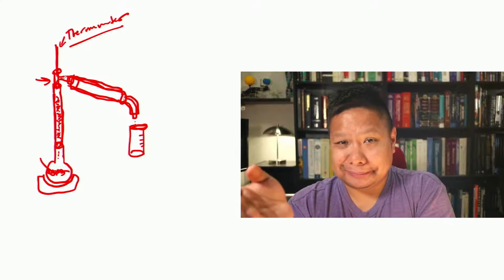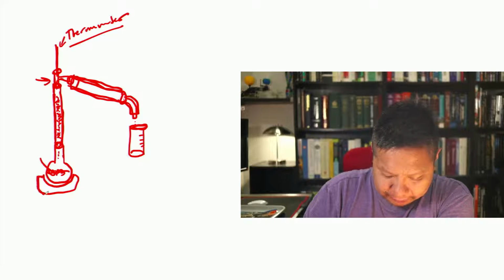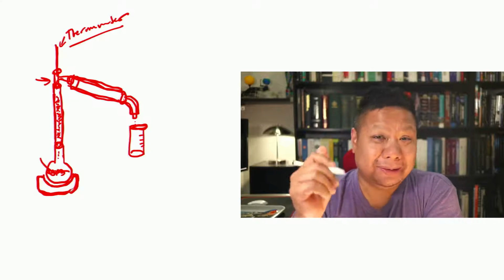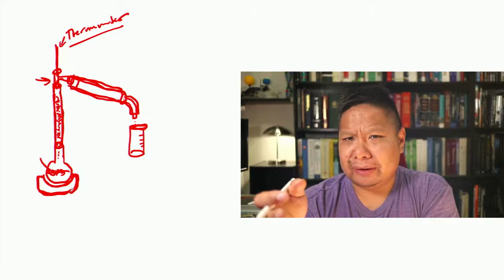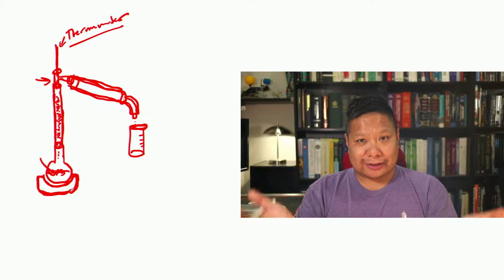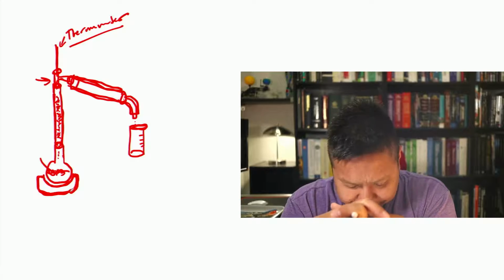Oh, I forgot to tell another story. In the organic lab, we always use things like heating mantles or hot plates or baths to heat things, right? And you should absolutely never use a Bunsen burner, because the vast majority of organic solvents are highly flammable, right? And they also have high volatility. They have low boiling points. So the vapors, if you pour it into a flask, will overflow from the flask and float on the outside of the flask. And so that's why you're not supposed to use an open flame, like a Bunsen burner flame. You're supposed to use safer heating sources like a heating mantle or a hot oil bath or something like that.